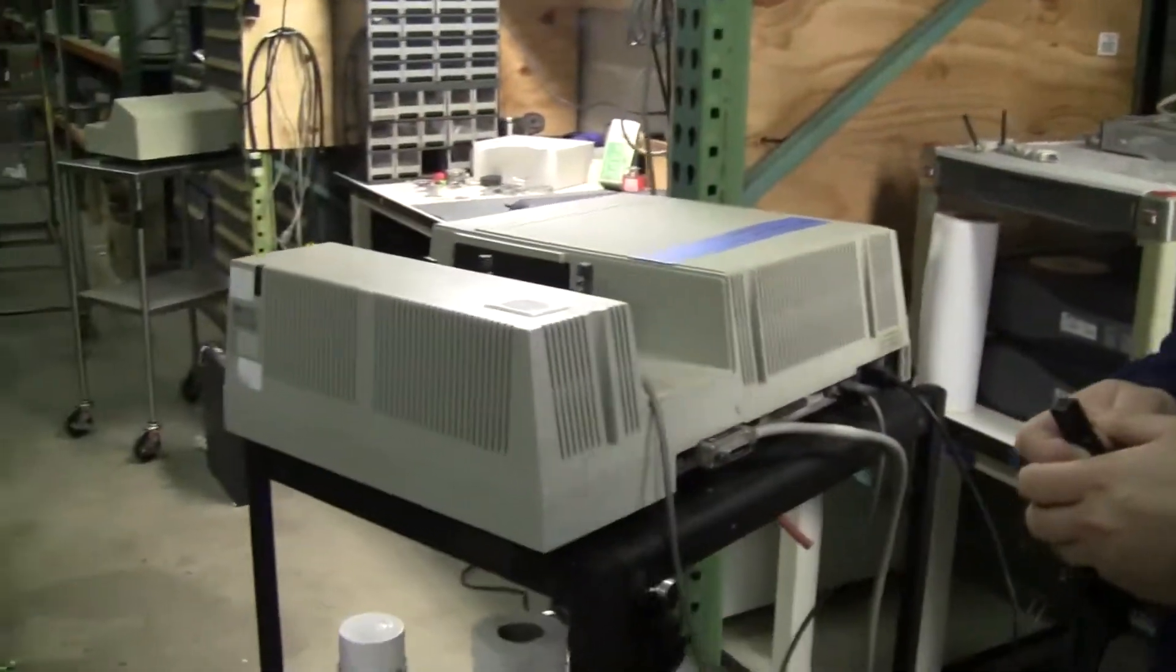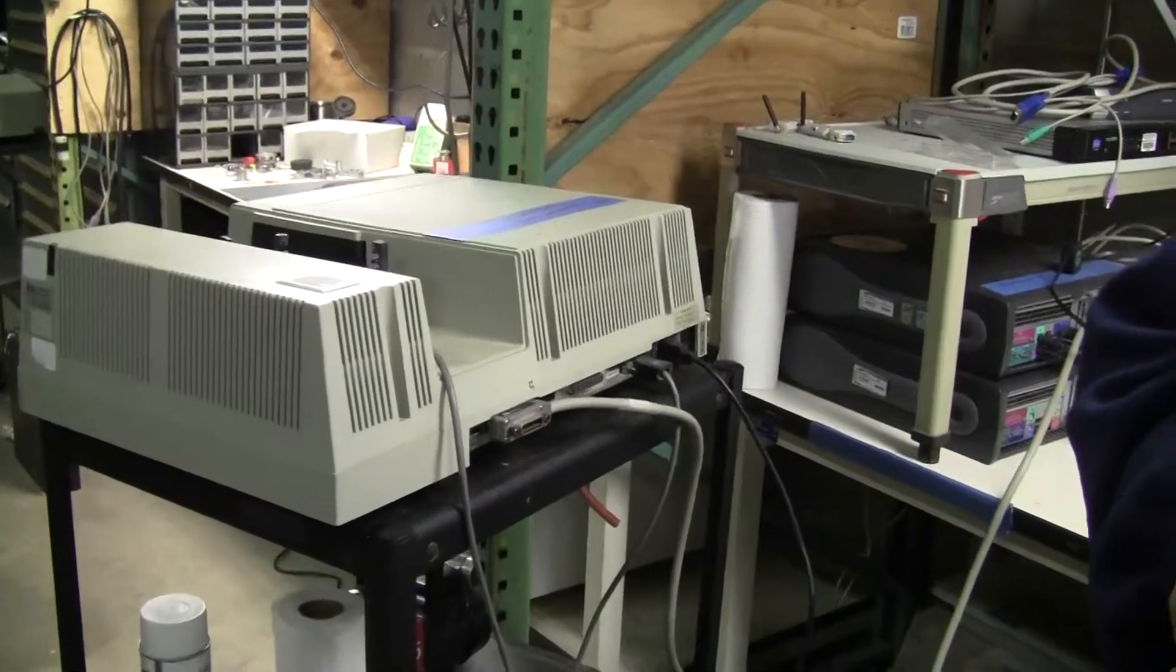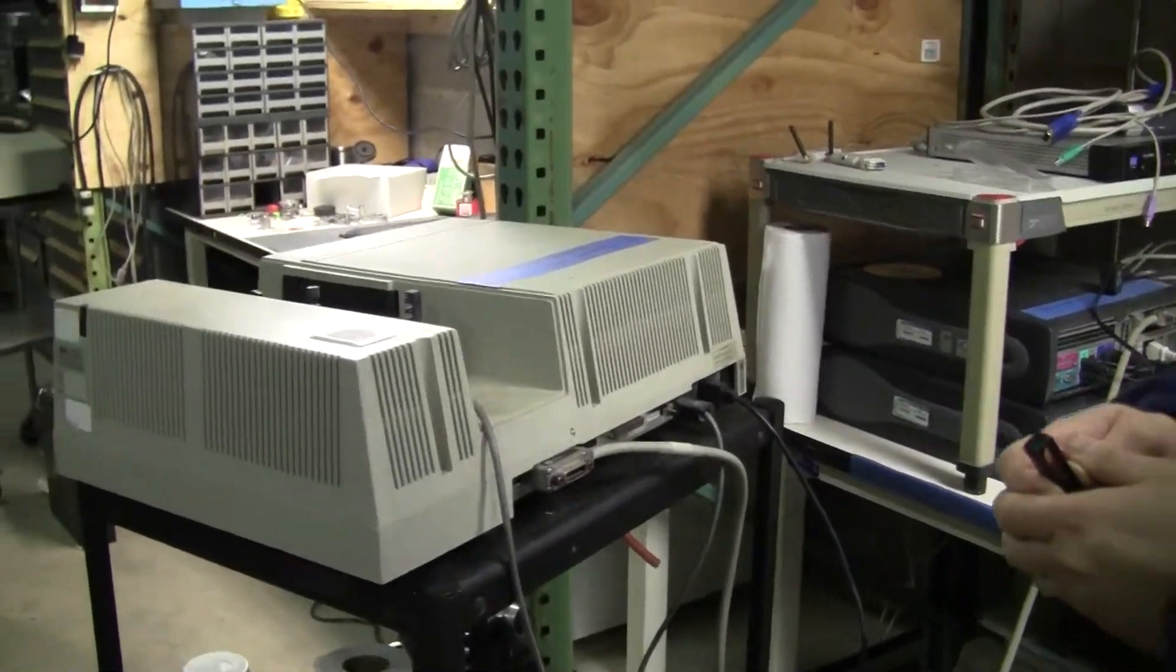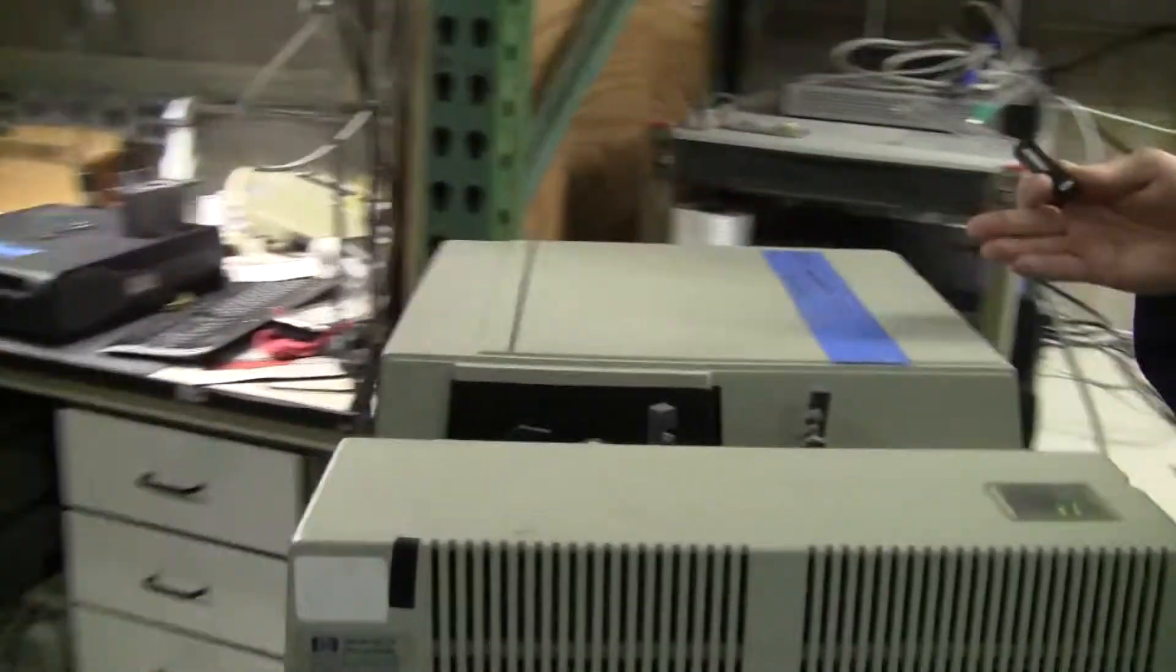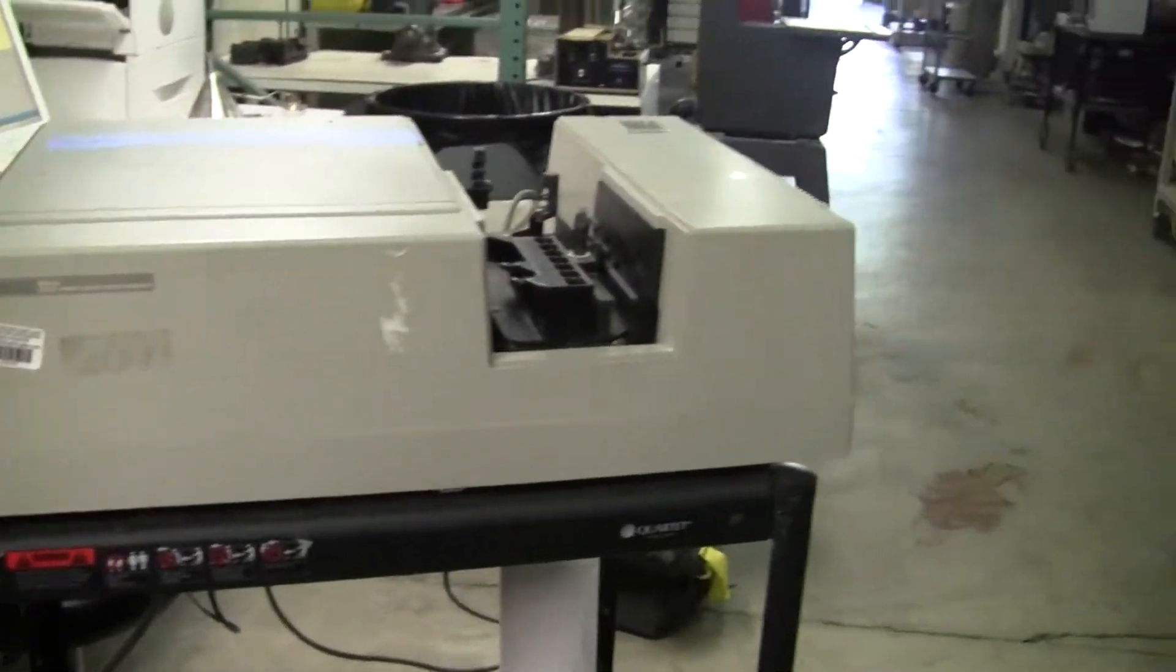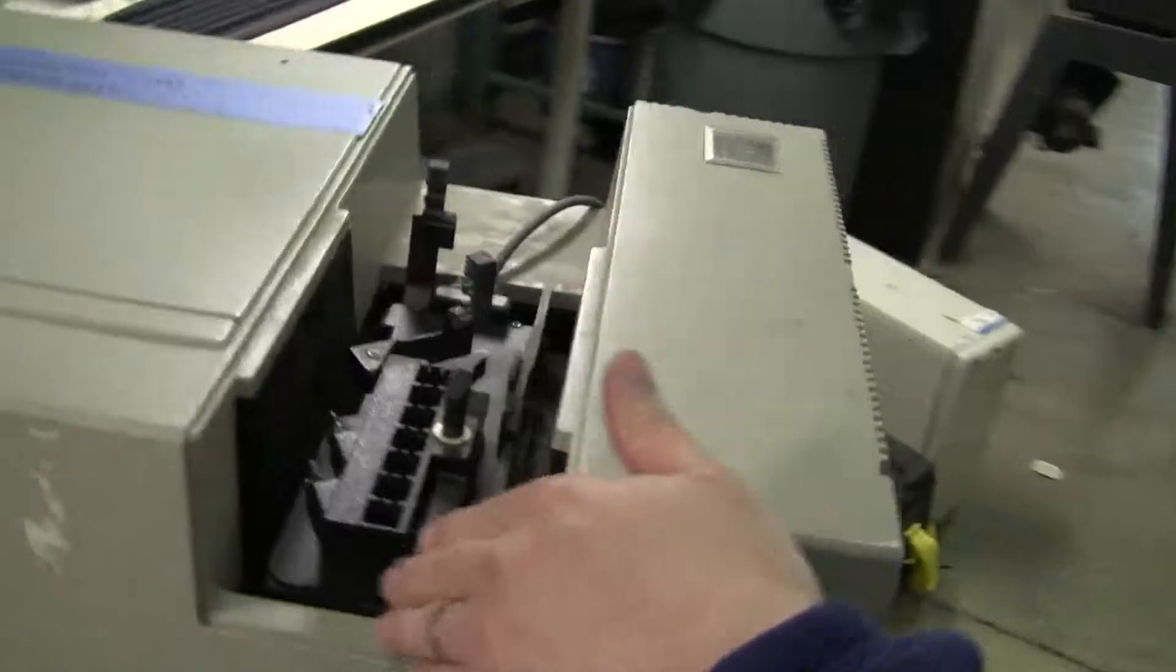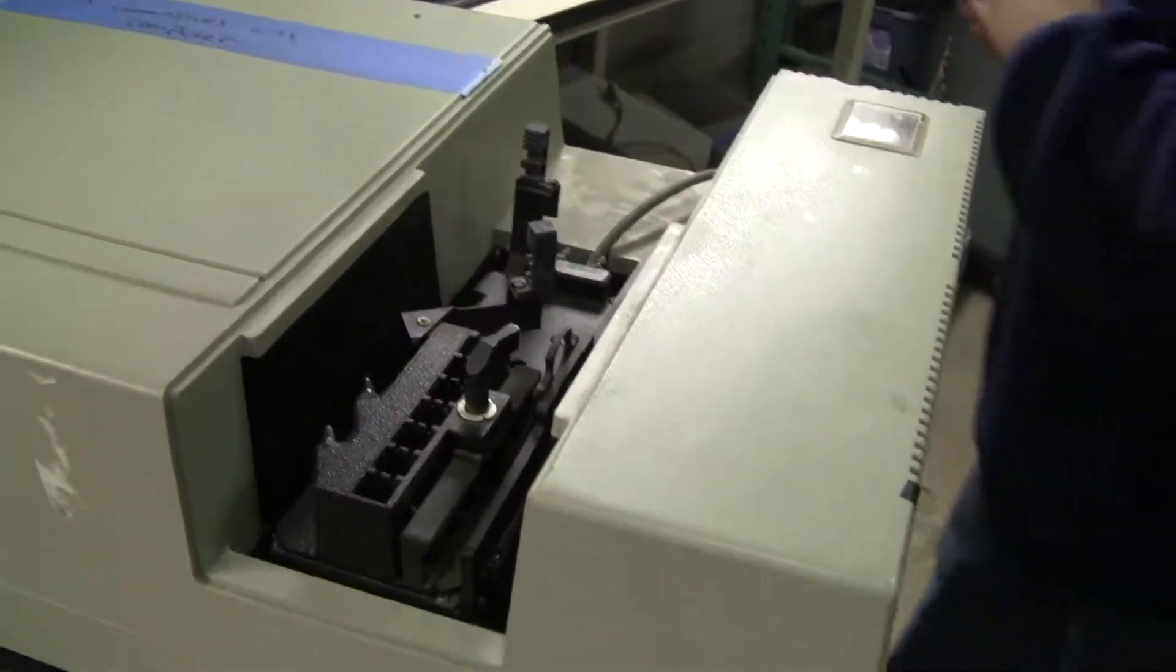This is an 8452. Take a look at the front, Cody. And it's an 8452A, actually. It has a multi-sample cell.